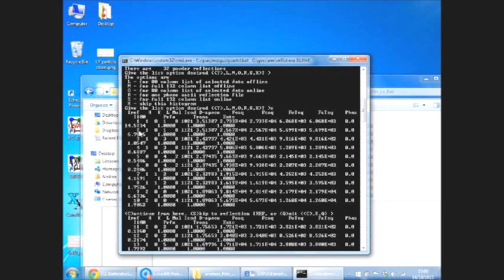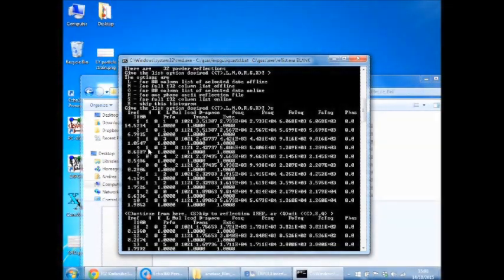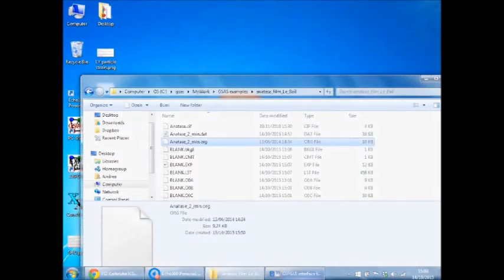So you can take these numbers, add them, and that will give you the relative intensities of each peak. Okay, and then you can quantify it relative to each other or relative to changes versus a single crystal. Okay, and that's that example done.